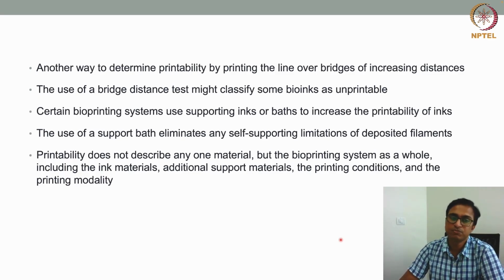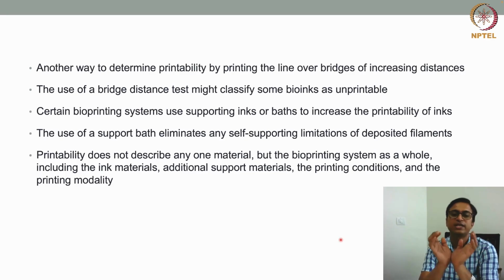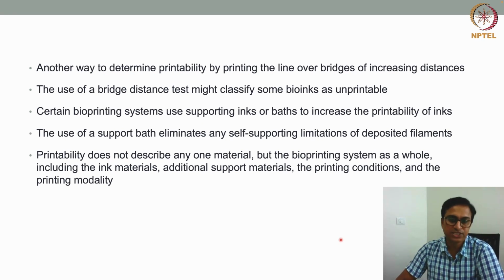So the use of a support bath eliminates any self-supporting limitations of deposited filaments. That means the support bath can hold the printed line or structure during the deposition, and it facilitates self-retention.